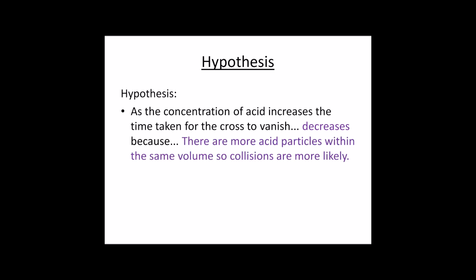And you should have something like this: when the concentration goes up, there are more acid particles within the same volume of solution, and so that means the collisions are more likely. When collisions are more likely, the rate goes up.